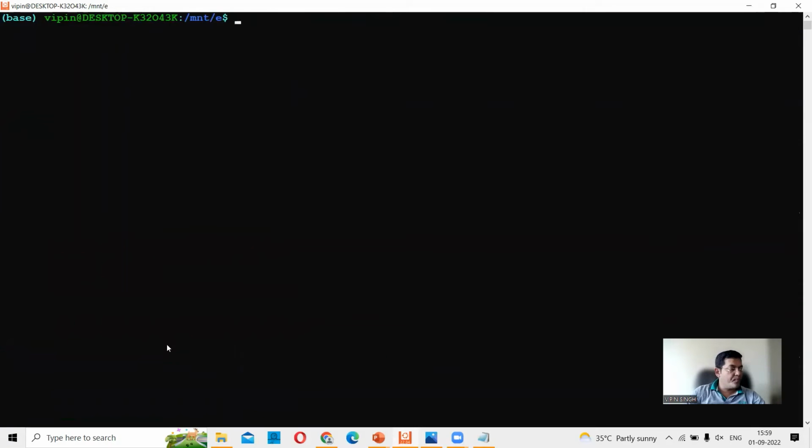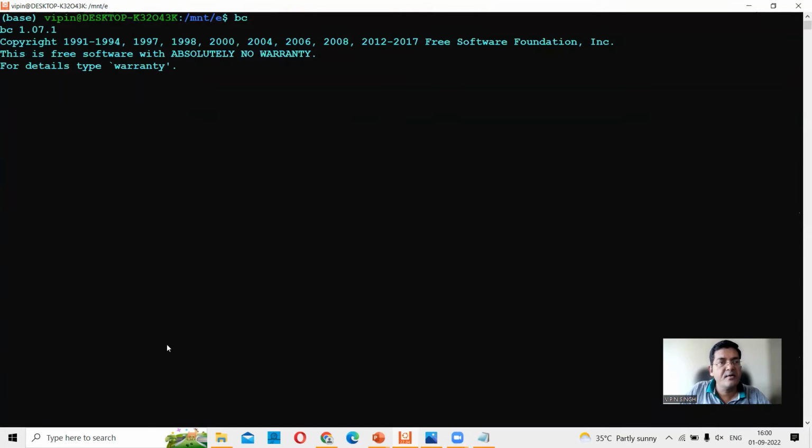Now let's say you want to print all lines that contain your sequence, right? So you know now that if you look at the row numbers of the lines that contain the sequence, the remainder is always a 2. And you will also remember that if you want to use your Linux terminal as a basic calculator, you can say bc, and this now transforms into a basic calculator. The way you calculate the remainder for a given division is by saying x%y. So let's say you want to see the remainder of 2 divided by 4. You say 2%4, and you'll get a remainder of 2.